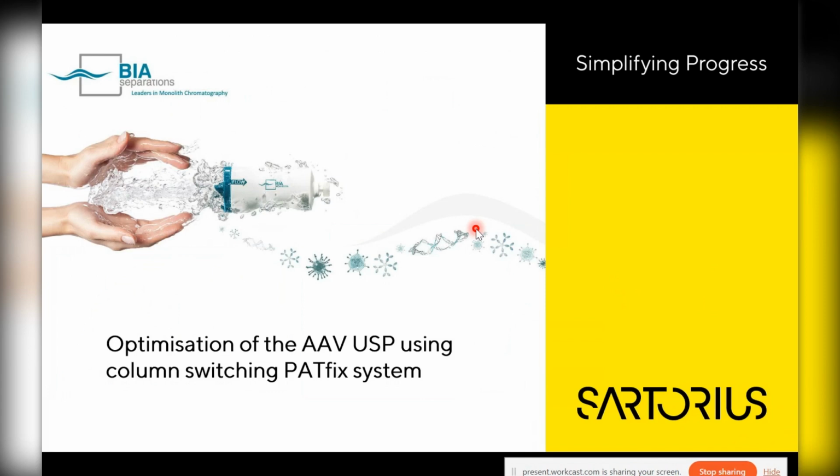Yeah, of course, this can be done downstream, but sometimes maybe it's also good to think about the upstream. Can upstream help to improve the ratio between empty and full, and then to lower the amount of partials? Can upstream boost the expression of AAV?